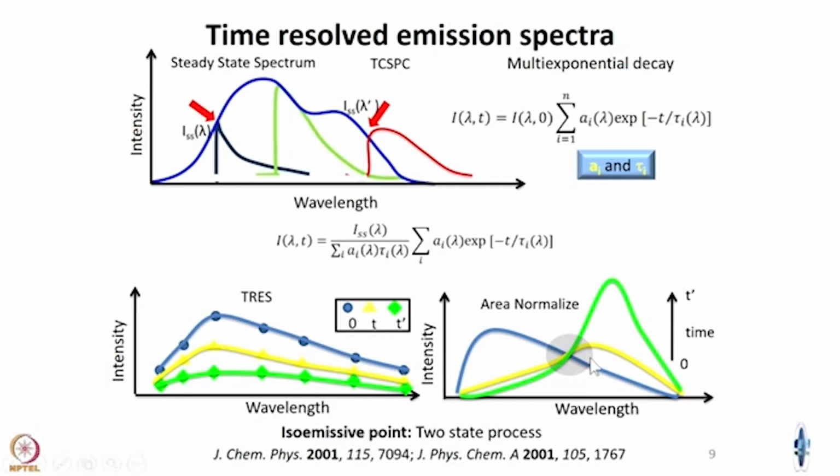The good thing about this approach is that it is okay if you are using the wrong model. Remember, in our earlier discussion, we had said that you have to break your head and work with the absolutely correct model if you want information about non-radiative rate constant and so on and so forth. But in this case, all you care about is the correct value of time resolved fluorescence intensity.